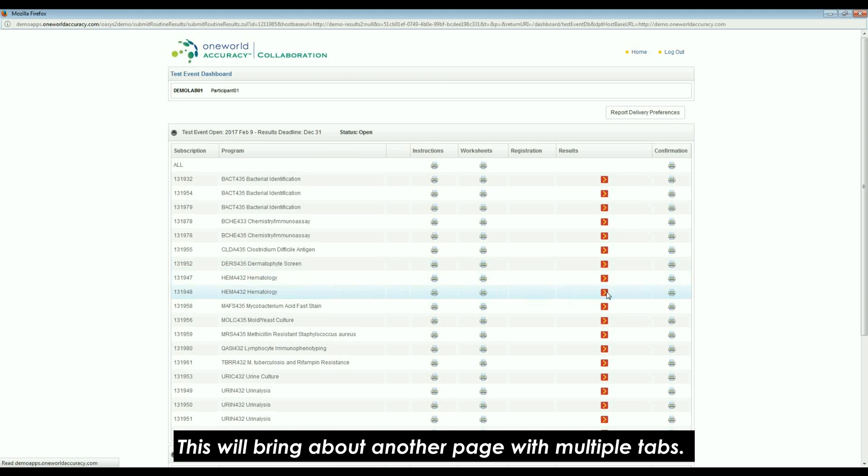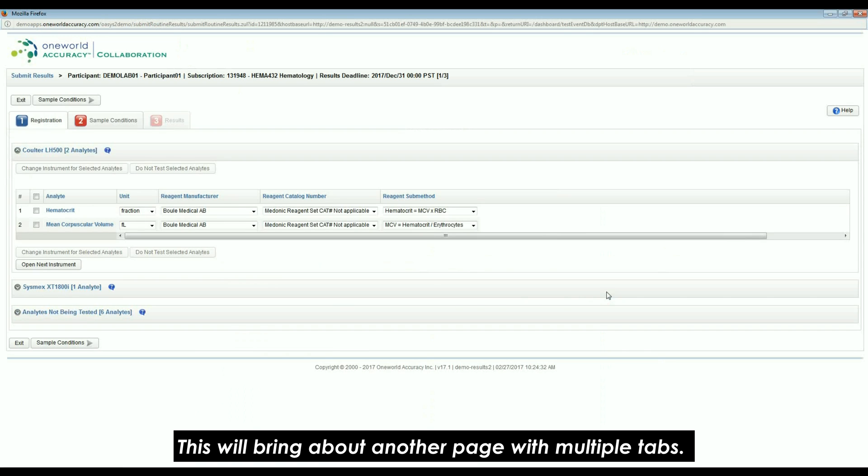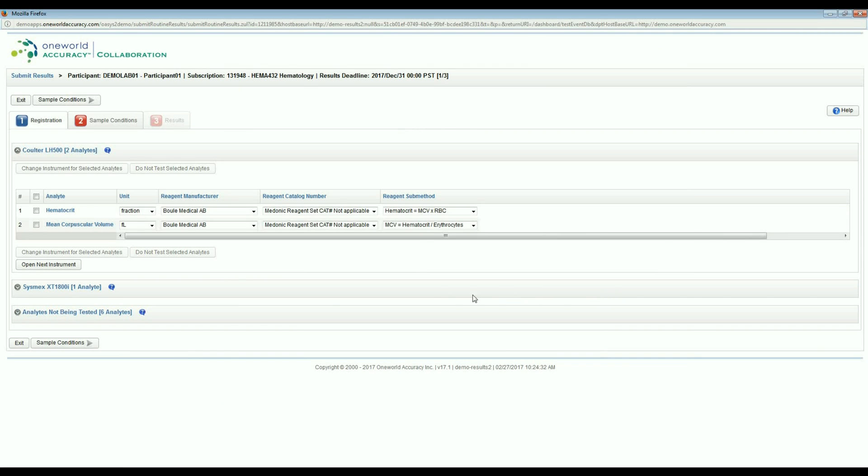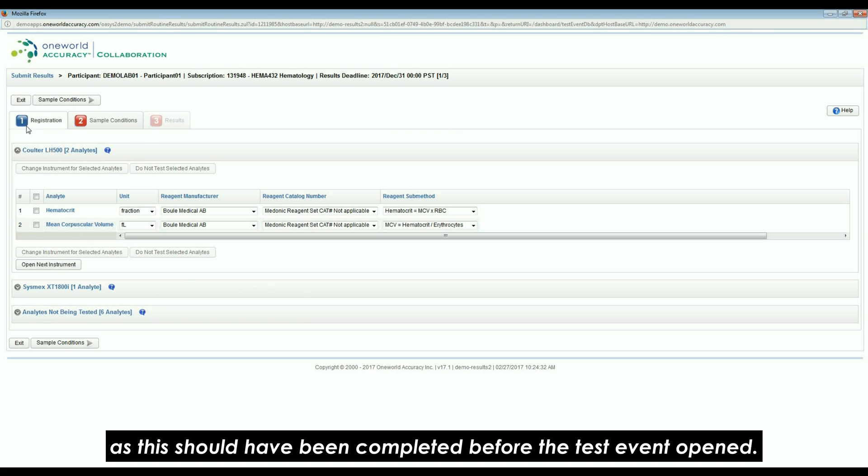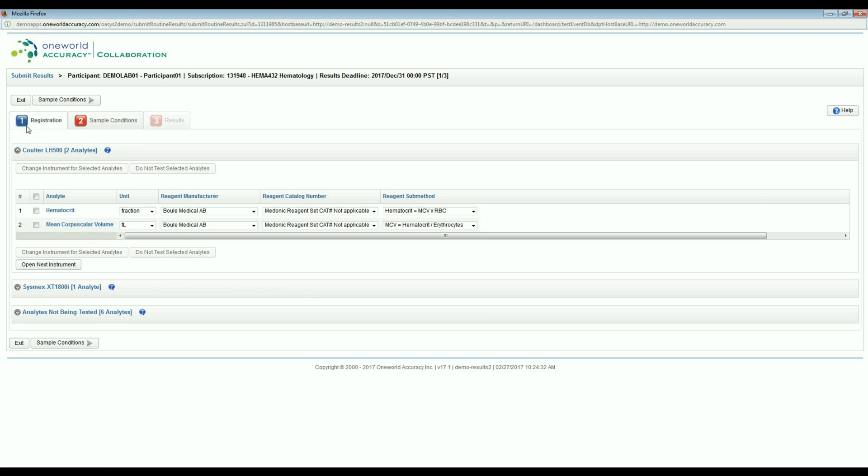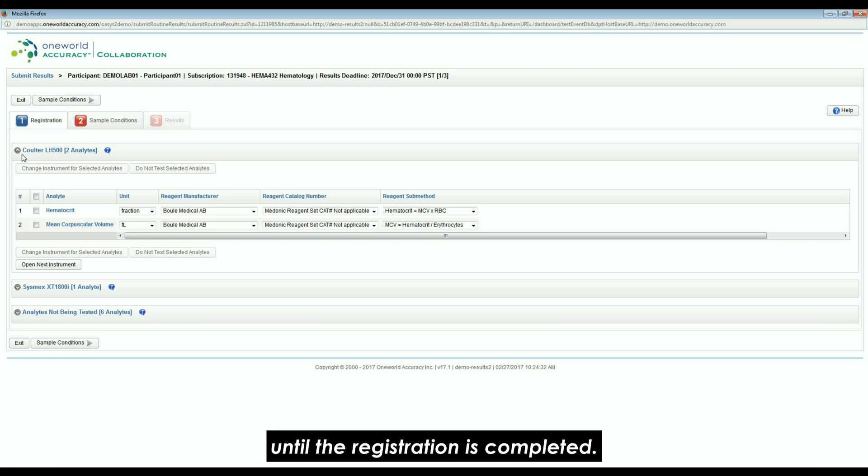This will bring about another page with multiple tabs. The first tab is for registration and should be blue as this should have been completed before the test event opened. If the registration tab is red, you will not be able to proceed to submit results until the registration is completed.